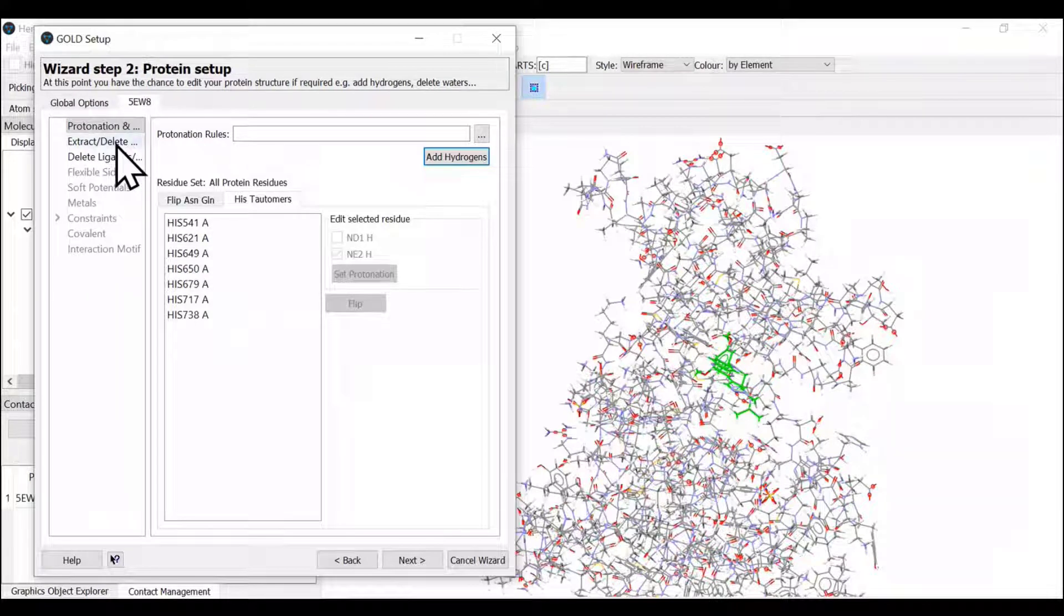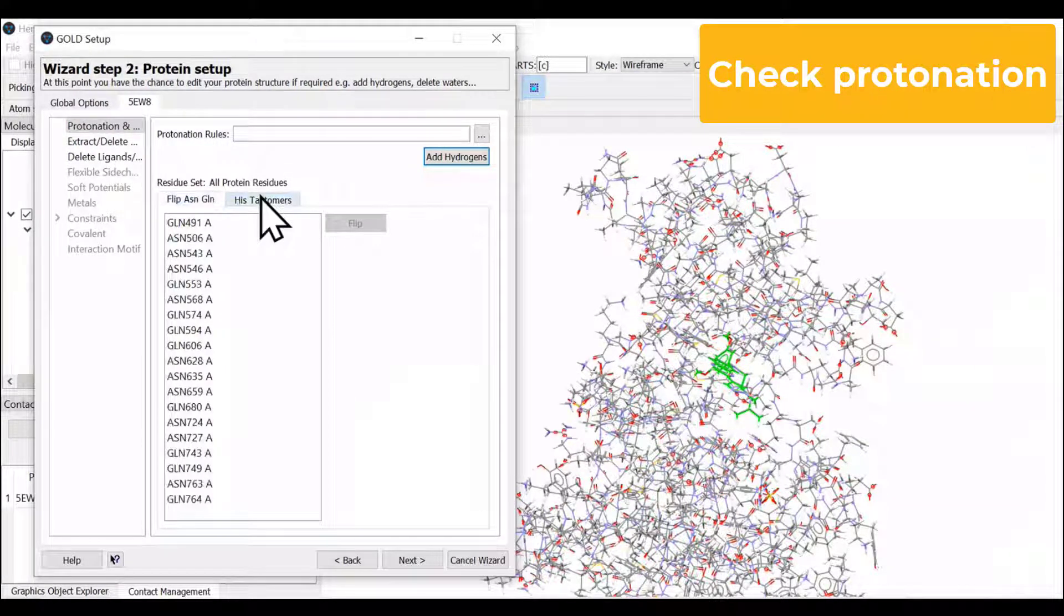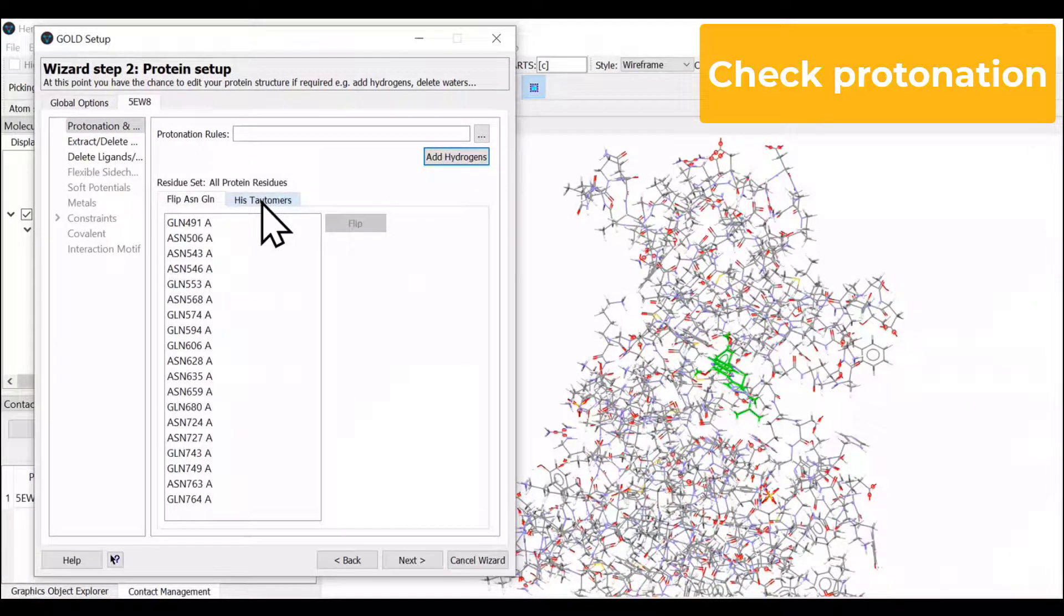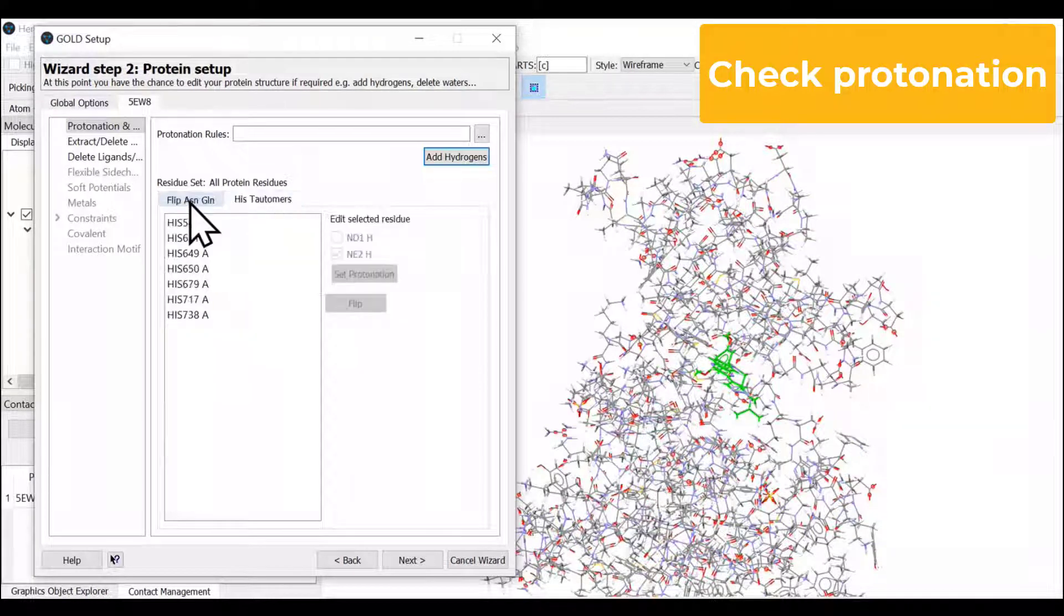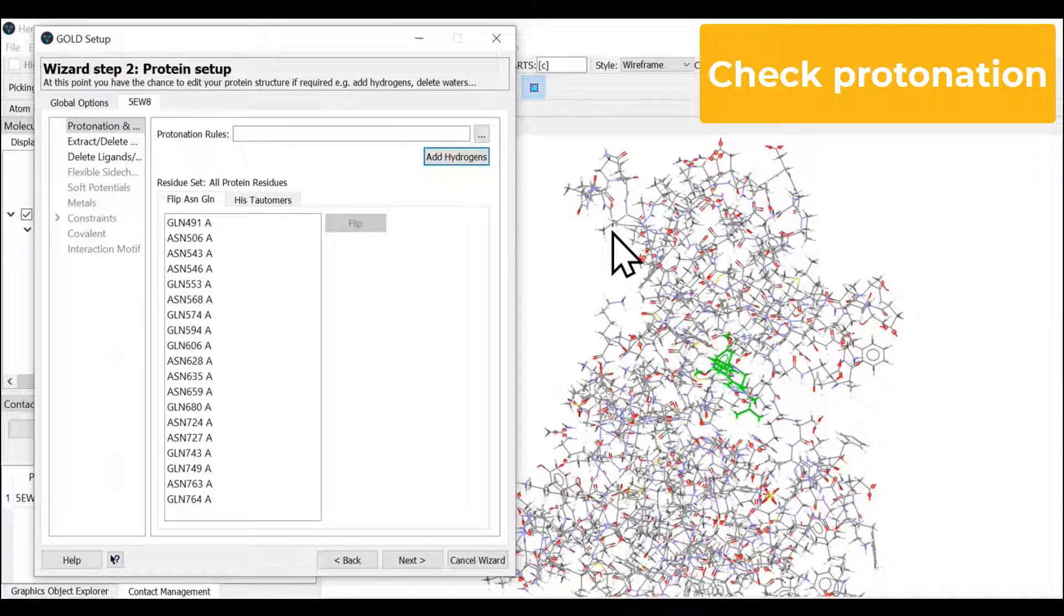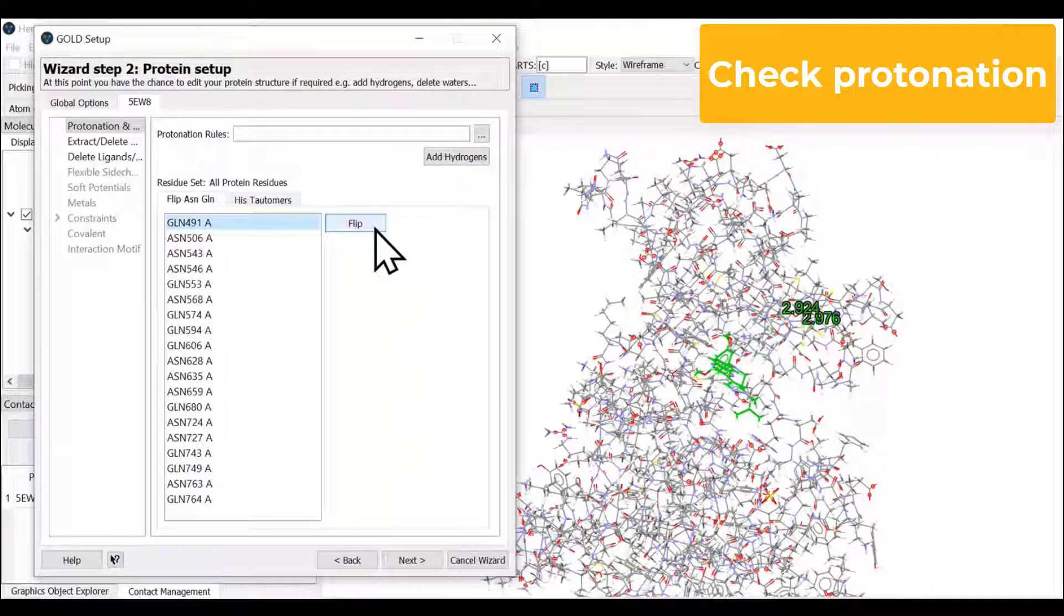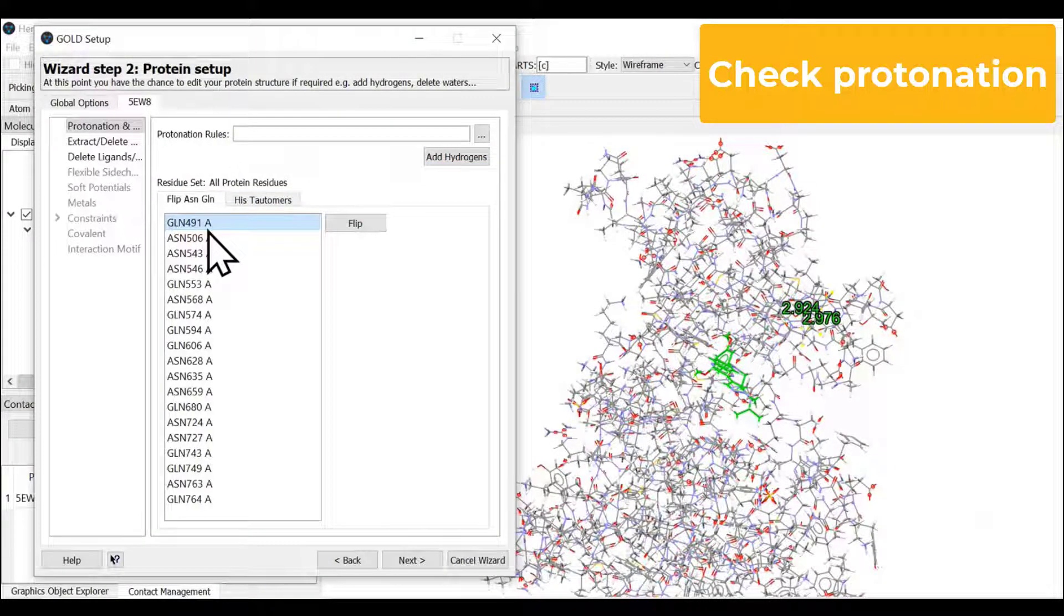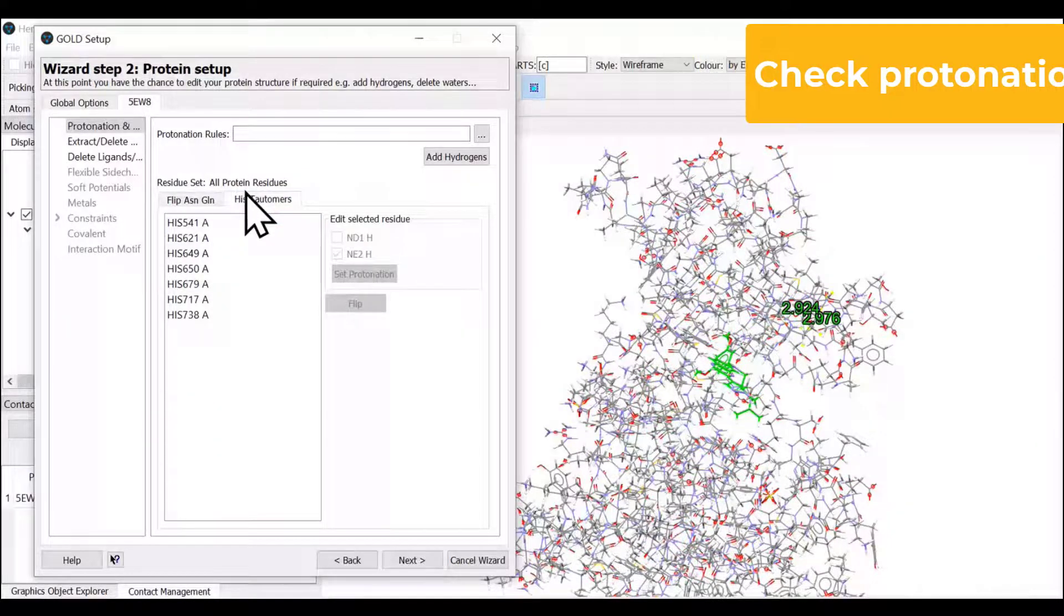We may also check for any problem with the tautomers, for example in case of glutamine, asparagine, or histidine. In this case, we didn't find any, so we're going to skip this. But it is possible to select and flip if you wish to see that the orientation is correct.